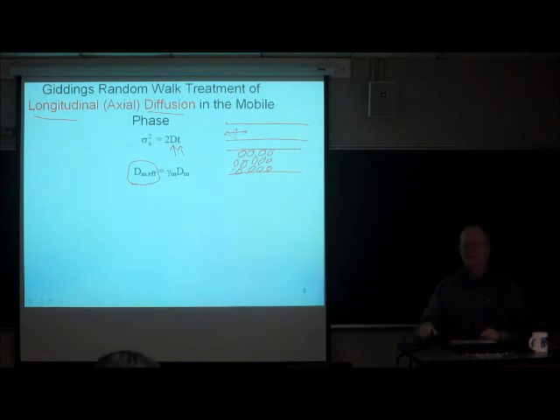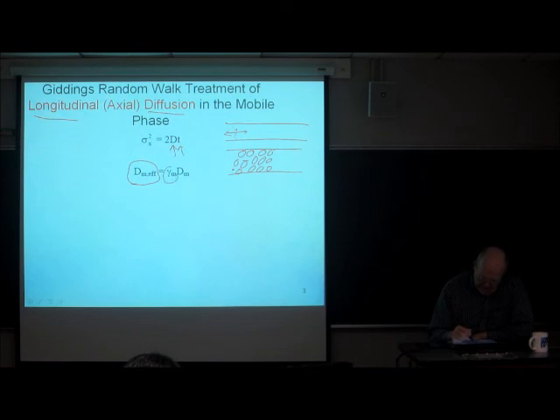Well, this molecule, its ability to diffuse, is screwed up by the presence of those particles. These molecules of solute are going to bang into those particles, if you will. And that's going to slow them down. It's going to make diffusion slower. And that's what this factor is called, this gamma sub m.